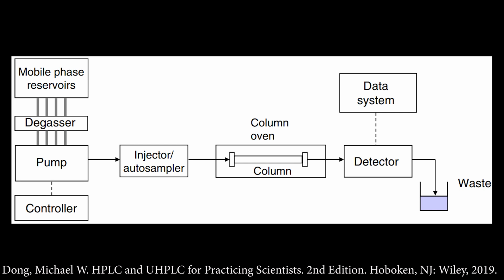But here, I want to point out a really big pitfall for students. When we're talking about method development and I'm asking you on an exam, how could you fix this method? Do not say, oh, well, I'm going to run a temperature gradient with the column oven, or I'm going to raise the temperature to 250 degrees. That is a terrible idea. Column ovens for LC won't go that high for good reason, because they're liquids, they'll evaporate, and we just don't do that. You can warm things up a little bit if you want to, but it's not a super important parameter in LC, and we don't change the chromatography significantly in a controlled way using the column oven, okay? So it's there to hold the column and maintain it at a consistent temperature because we don't want shifting peaks.